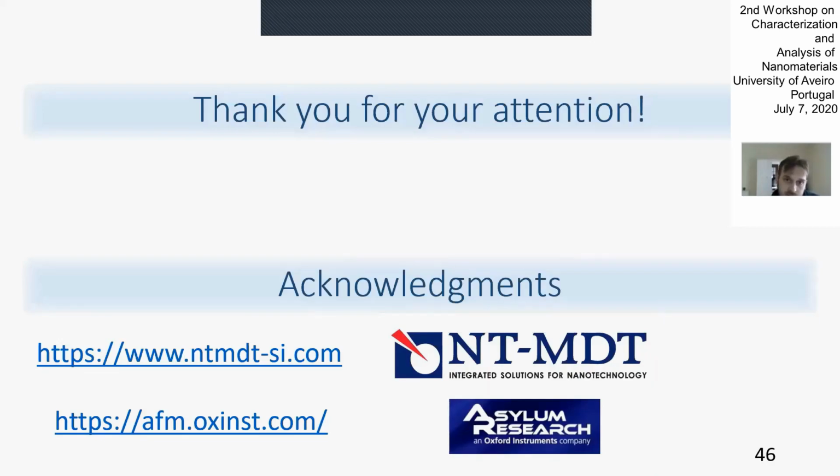I'm asking about lateral resolution. Yes, lateral resolution. Lateral resolution depends on the tip. To have really nice lateral resolution, the best solution is to use sharp tips. For sure, it's quite difficult because usually the tips need a conductive coating for piezo response measurements, and this increases the size to at least 15-20 nanometers. So you are limited in these values.